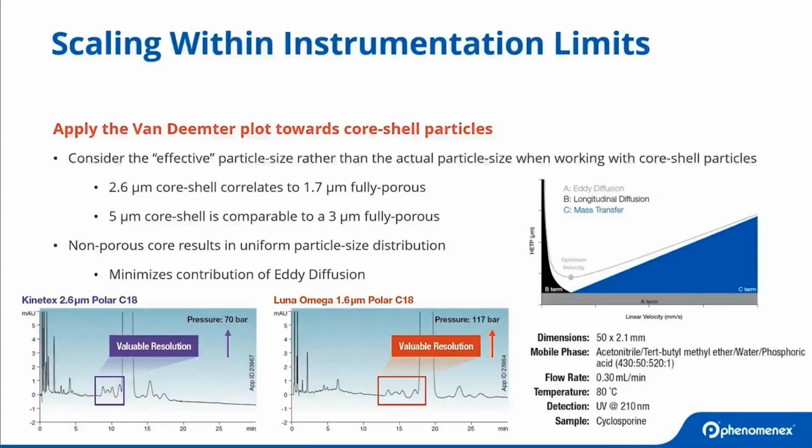The only caveats of which to be mindful are that fully porous particles do lend themselves to higher sample loading, and so as a result, it does work out when you do have ambitions of scaling up to a preparative purification, for which fully porous particles are often preferred.